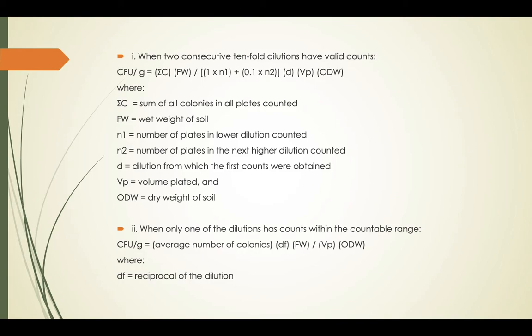All right. So now let's talk about the activity proper. The component of the activity that is left for you to understand and perform is the quantification part. There we have two formulas for computing standard plate counts for soil microbes. If you have two consecutive tenfold dilutions that have valid counts, you use this formula. Okay?